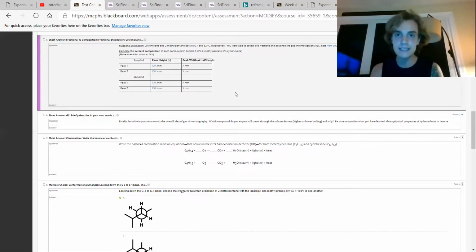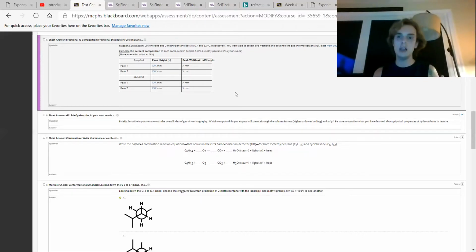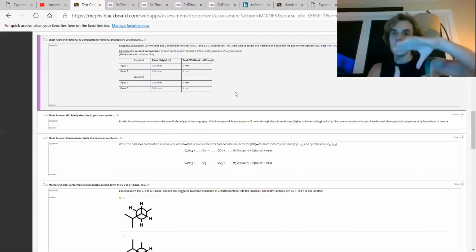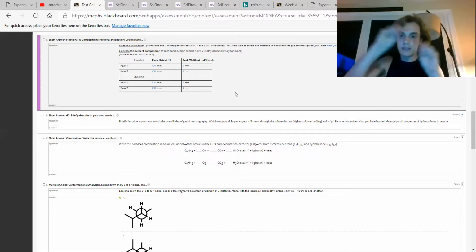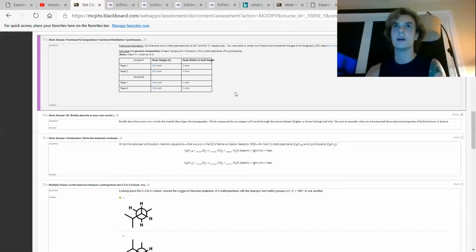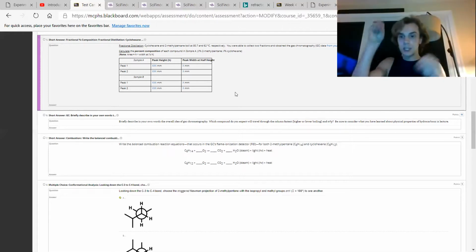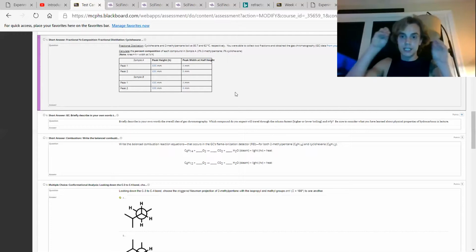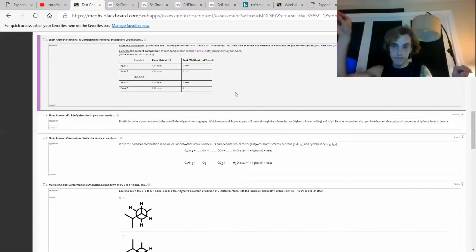So as you increase the temperature of this column with the cyclohexane solution combined in there, each one has a difference in boiling point of 18 degrees. So each one is going to vibrate, all right, gain kinetic energy from the potential energy of temperature by a certain degree, all right? And because their boiling points differ by 18 degrees Celsius, the degree to which they absorb this energy is going to differ greatly, all right?